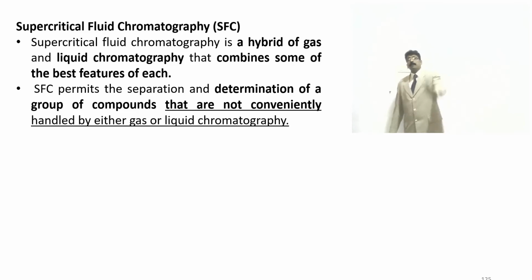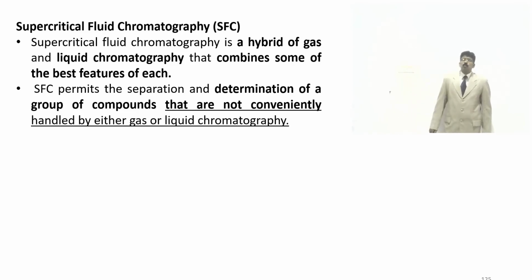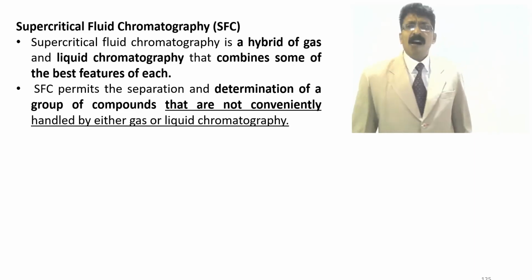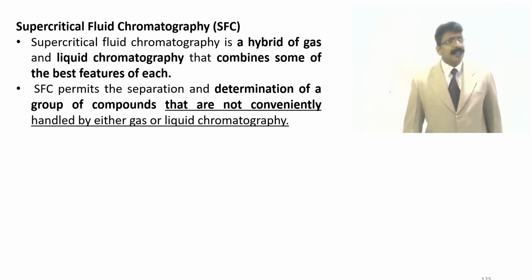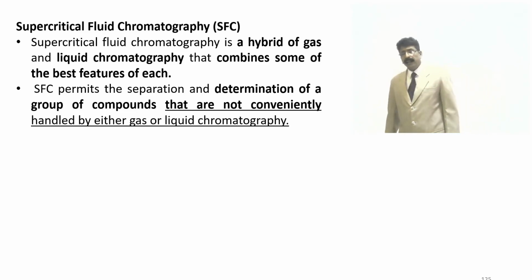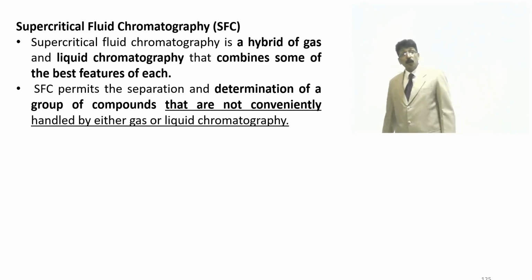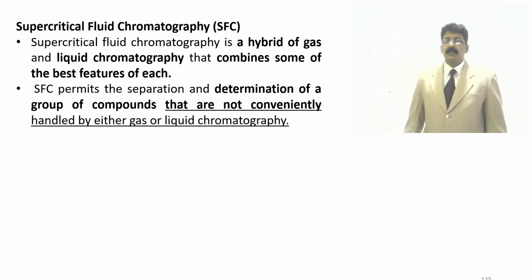Suppose compounds are unable to be isolated or separated in normal gas chromatography, in HPLC, in ultra HPLC, or in hydrophilic interaction liquid chromatography, then we can do it by means of supercritical fluid chromatography.